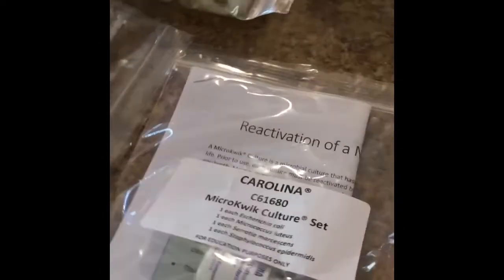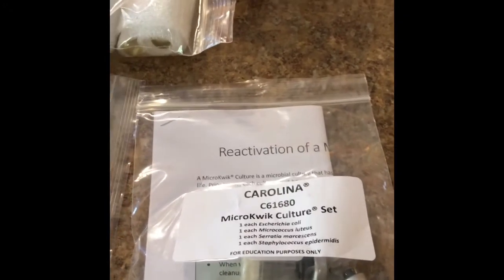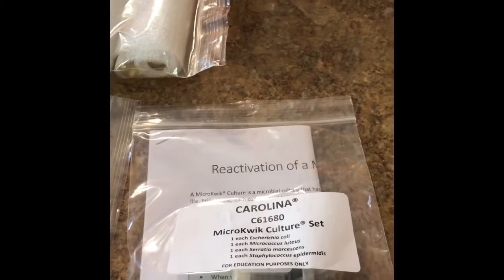Okay, now I have in my kit left E. coli and Staphylococcus epidermidis to rehydrate. So I'm going to do that. And I'm just going to take the metal piece off here. So I'm going to stop this video and then I'll upload the next one showing you the procedure, just so you know.